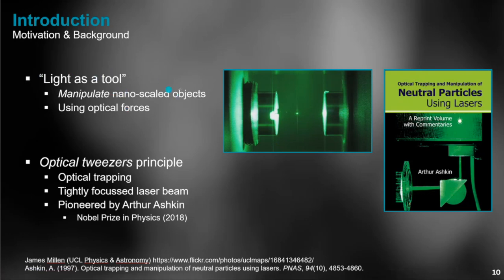He really manipulated nanoscale objects, creating these optical tweezers, and with these optical tweezers, he was able to trap particles. He was able to really define where they're located, squeeze them, manipulate them on a very precise scale. And he figured out that this is really a tool to create a new tool in this very biophysical field, because it's very precise and it can be calculated, and it can be really useful to look into cells, to look into particles.